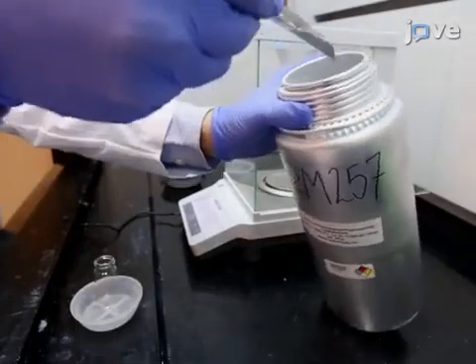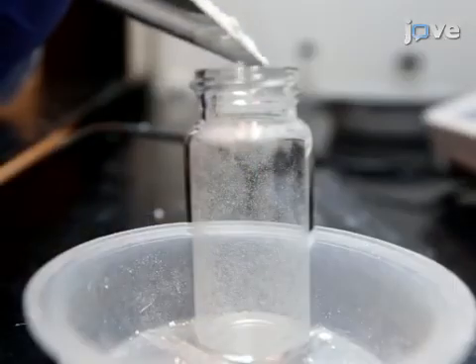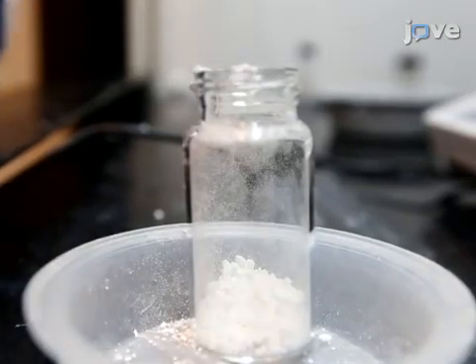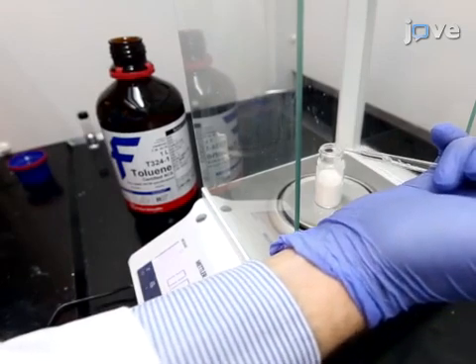To begin, add 4 grams of RM257 into a 30-milliliter vial. RM257 is a diacrylate mesogen and is received as a powder. Dissolve RM257 by first adding 40 weight percent of toluene.